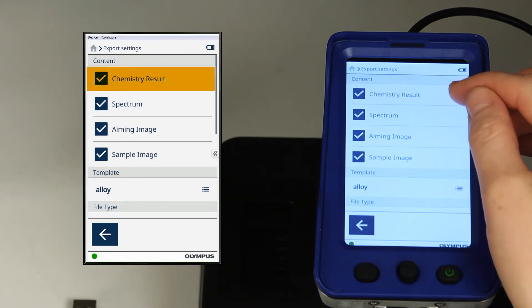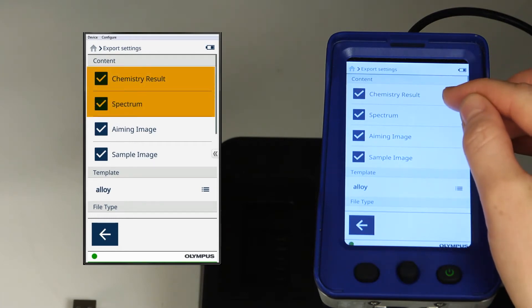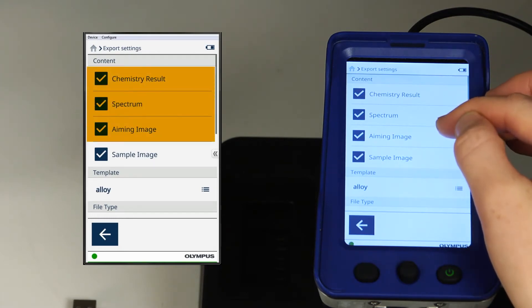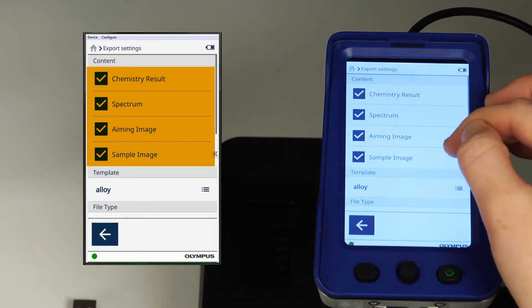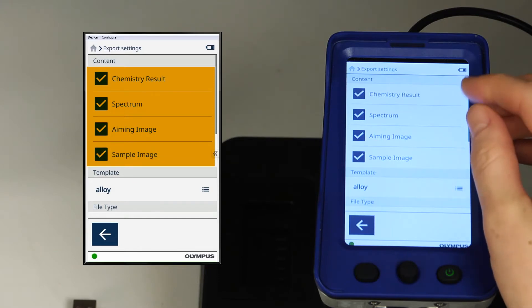Chemistry result, spectrum, aiming image, and sample image can all be exported.